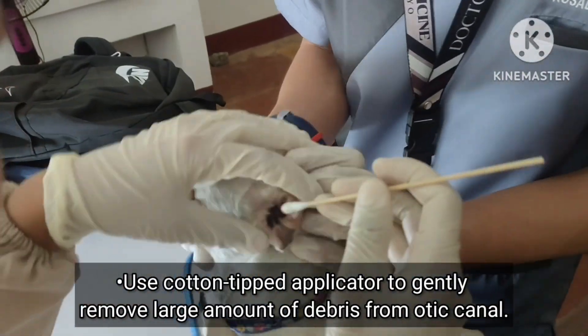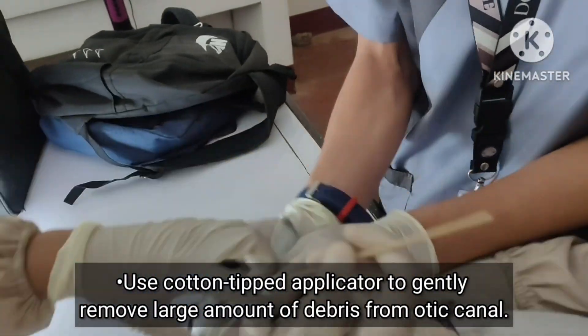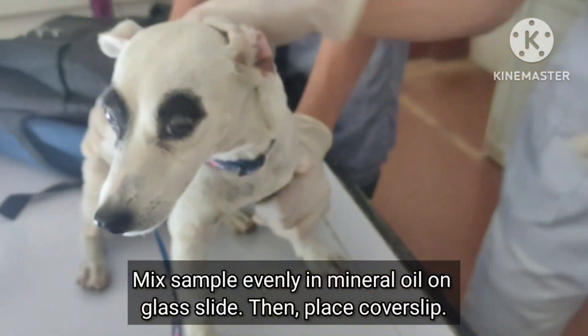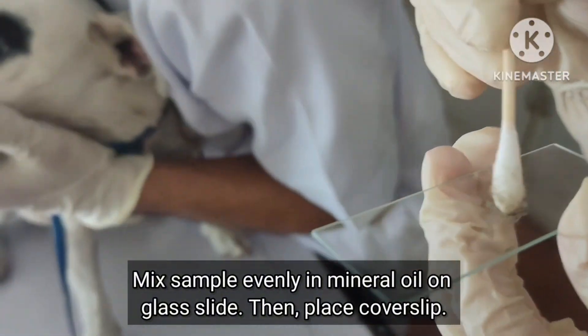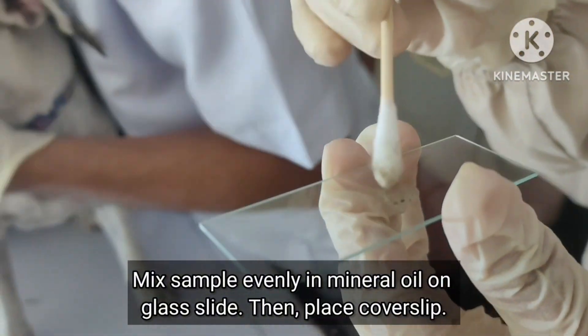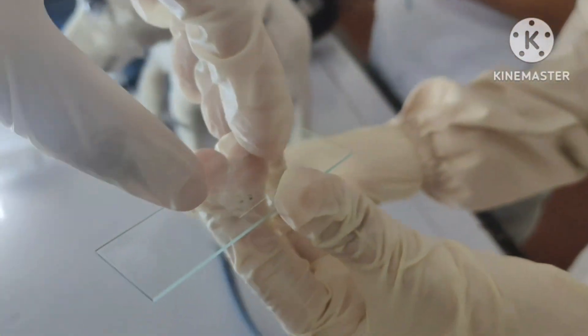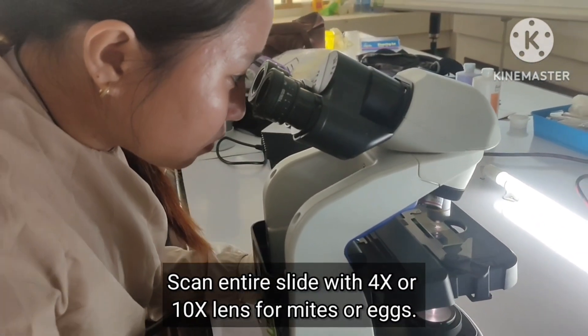Use a cotton tip applicator to gently remove a large amount of debris from the opening of the ear canal. Make the sample evenly in mineral oil on glass slides and place coverslips. Then scan the entire slide with 4x or 10x objective to look for mites or eggs.